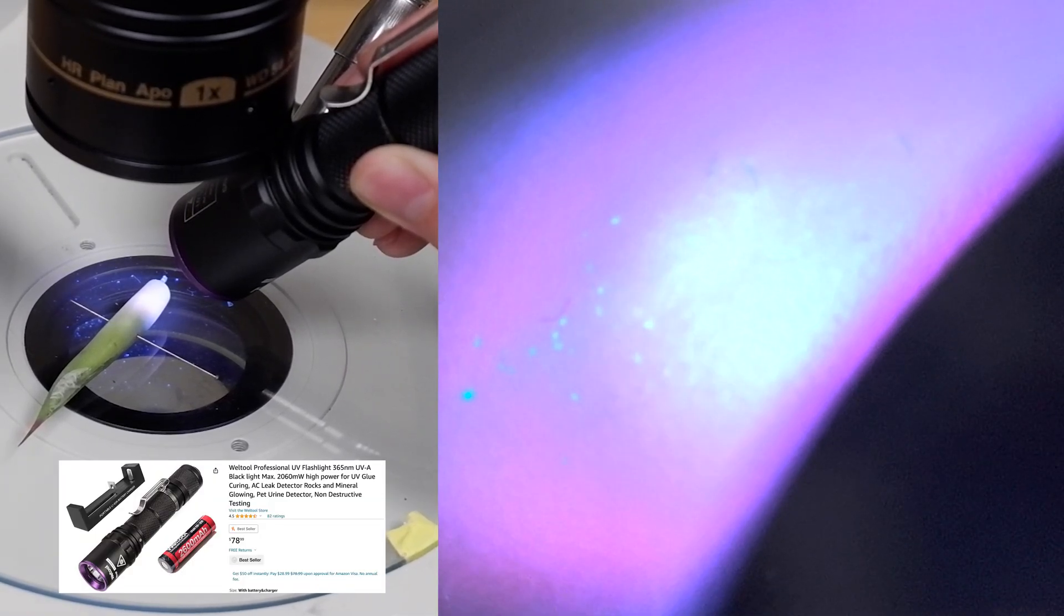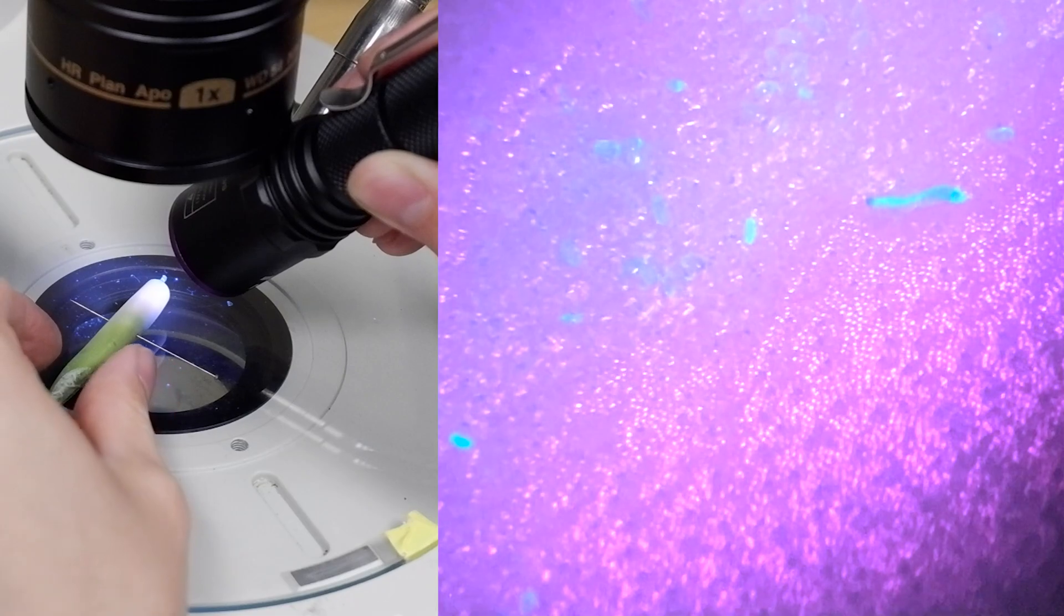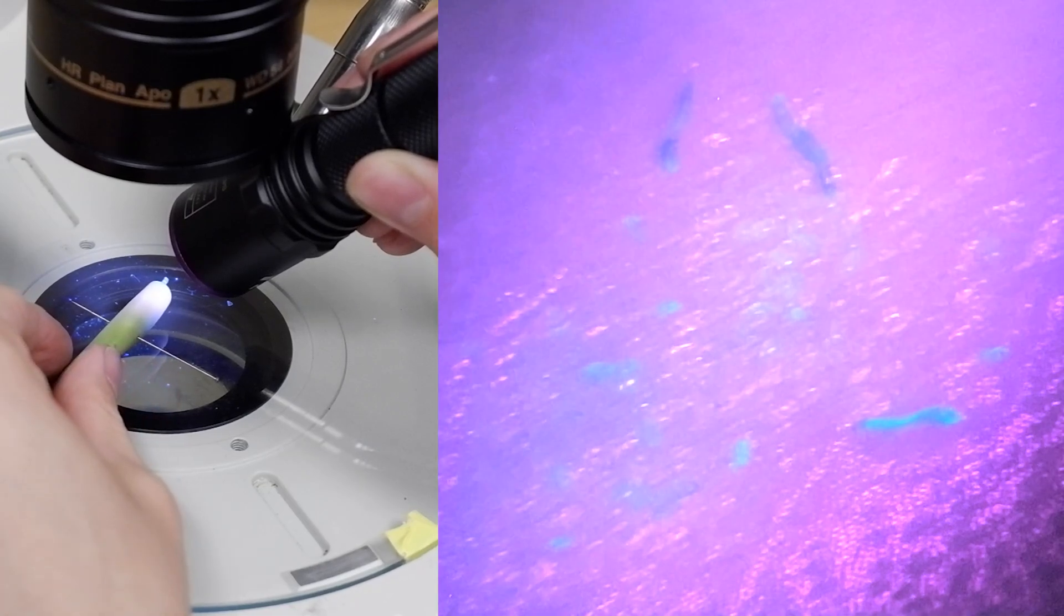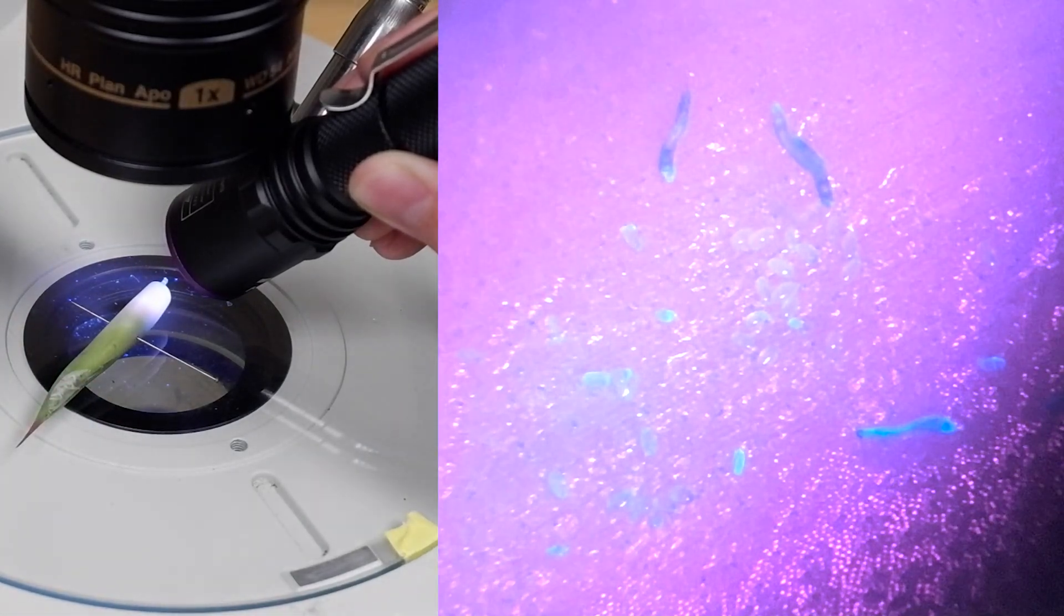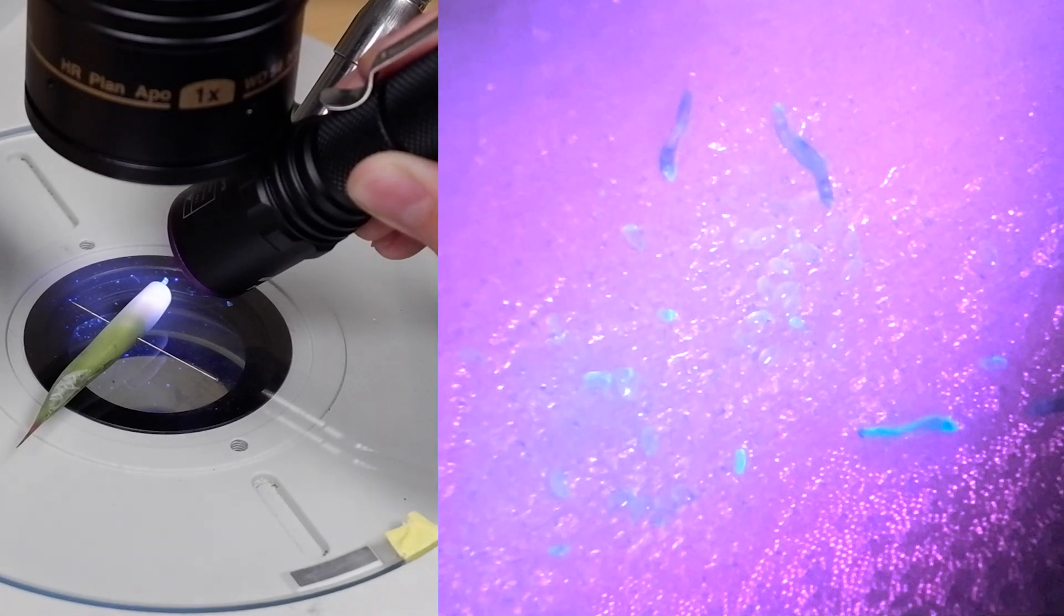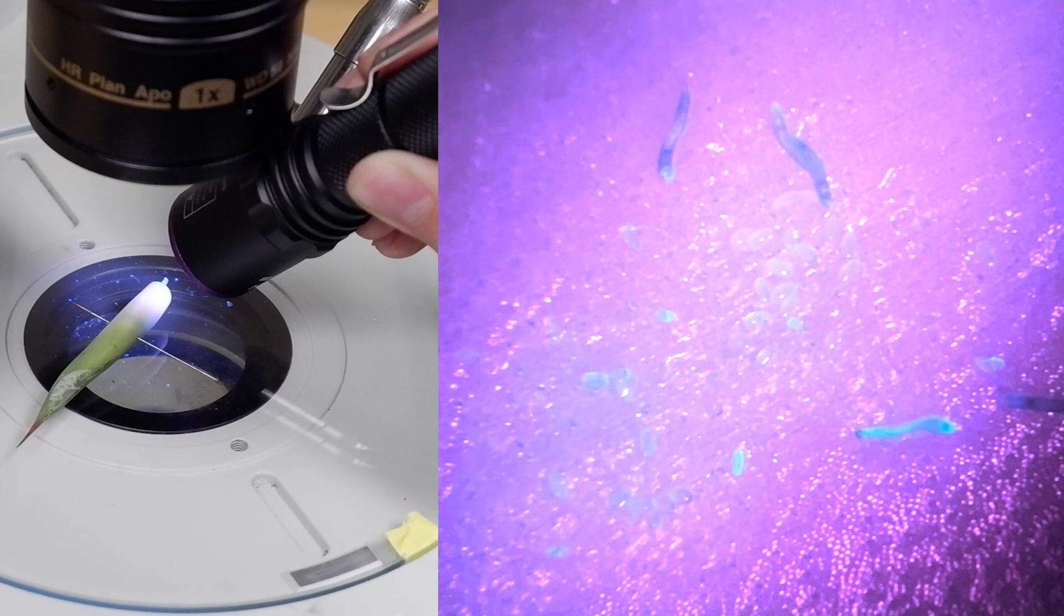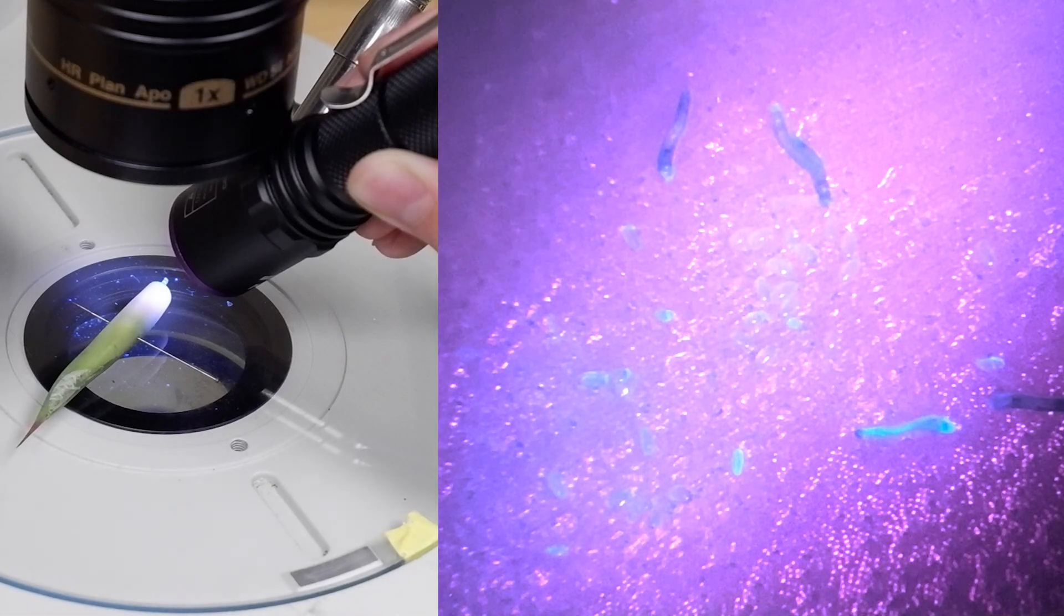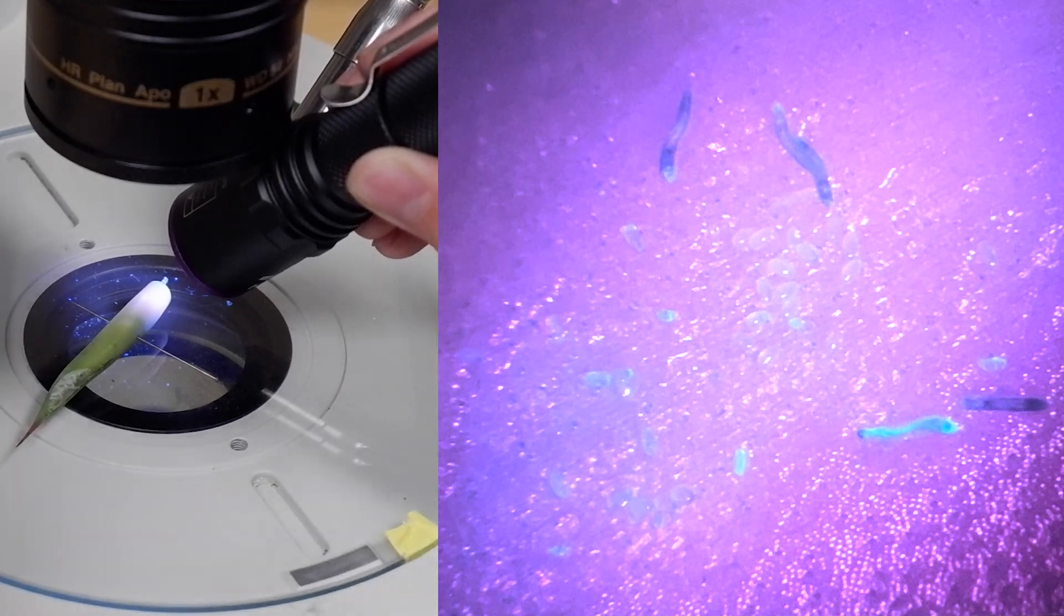You can see some of the mites there, although it is being lit out a little bit on the screen as well. But let's zoom in a little bit. And we can really start to see some of the eggs. So the round football things that are fluorescing a little bit bluish. And then you can see a dead mite, which is the guy who's a bit more whitish down on the right-hand side who's not moving. And there's living mites up top.